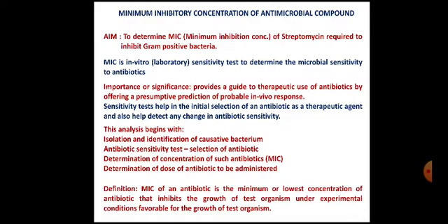The definition of MIC: the MIC of an antibiotic is the minimum or lowest concentration of antibiotic that inhibits the growth of the test organism, that is the test pathogen, under experimental conditions favorable for the growth of the test organism.